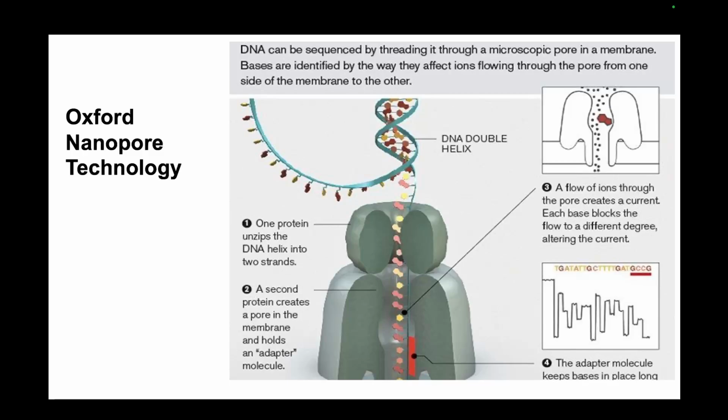So what happens next is, you started off with a sample with the whole DNA, you broke that DNA into small pieces, and you sequenced these small pieces. Now, the next step is to know where these particular sequences of DNA came from in your original genome, because you only have stretches of the DNA, but you do not have any idea where those stretches came from. To do that, we'll follow a series of steps and ultimately do alignment. But bear with me. Now we are moving on to the next step. After you sequence, how do you identify where that particular read came from?